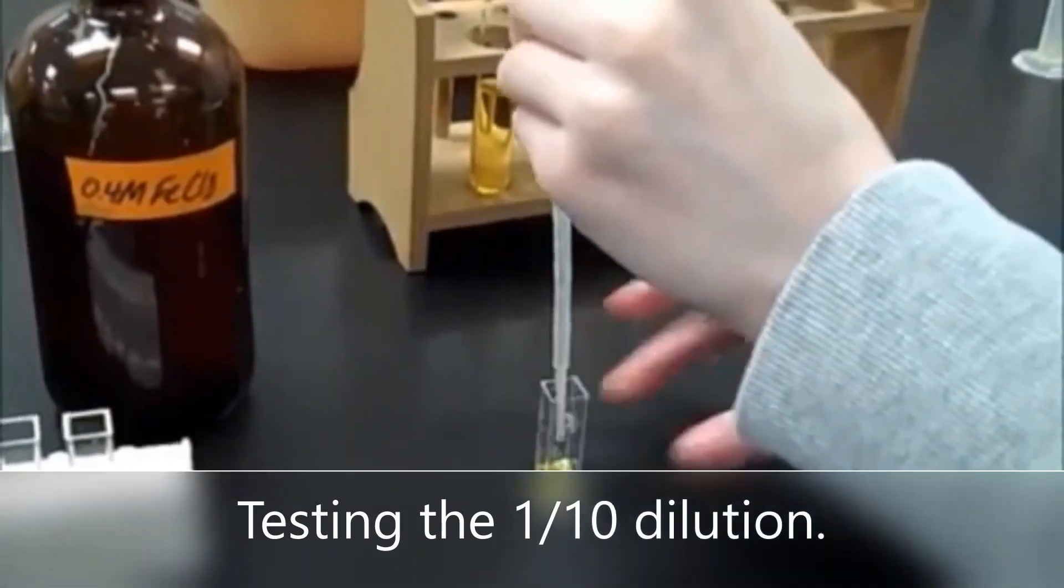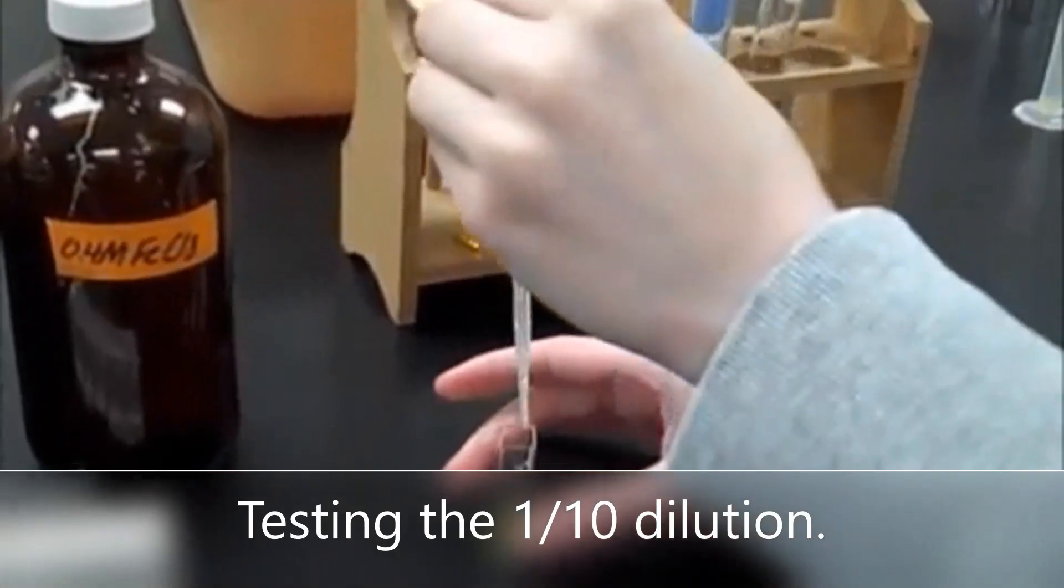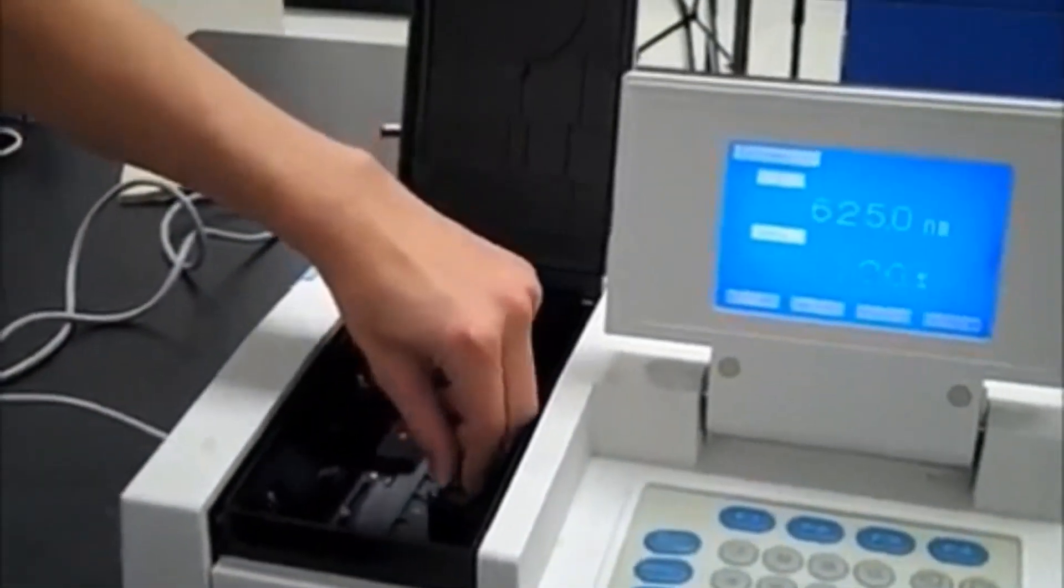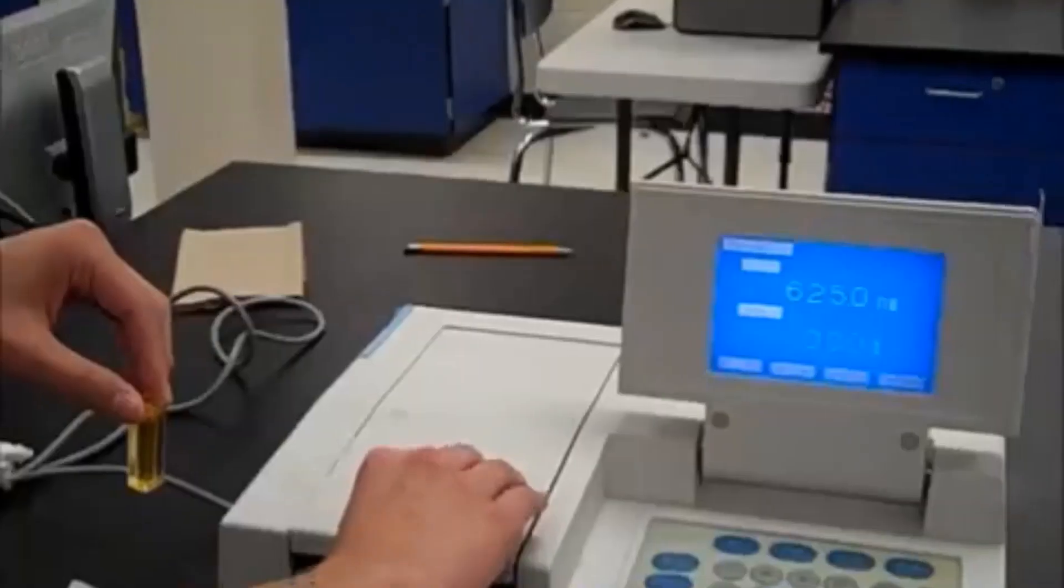Each sample will be tested to determine its percent transmittance. First we see testing of the 1 to 10 dilution. The transmittance for the one-tenth dilution worked out to be 97.1 percent.